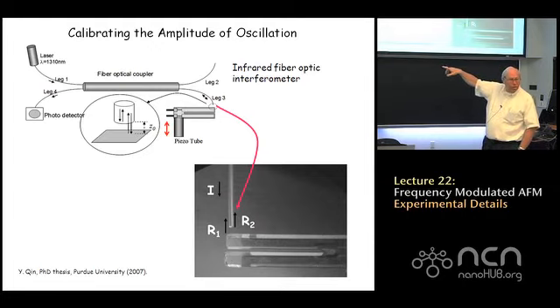So some of the light contained in the fiber optic is reflected at the interface R2, and some of it emits into air and is then reflected by the top tine of the tuning fork, indicated by the coefficient R1. And depending on the separation of the fiber optic from the tuning fork, the relative phases of R1 and R2 can be varied.